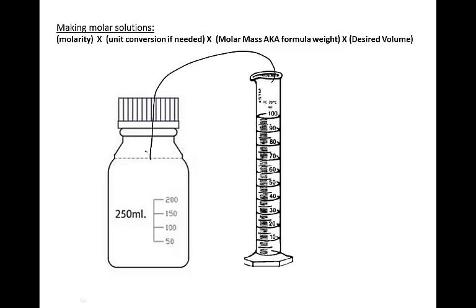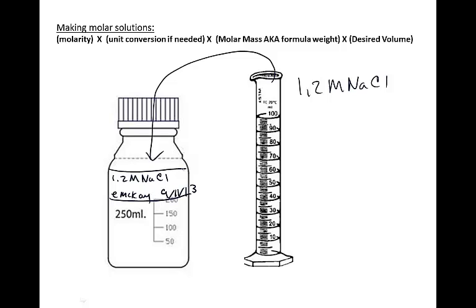We usually store things in objects like reagent bottles. So you would pour carefully your 1.2 molar sodium chloride solution into the reagent bottle of an appropriate size. You would add a piece of tape. You would write the concentration, 1.2 molar sodium chloride, first initial, last name, the date, and if there were hazards, that's where it would go. But this is salt water, so we can leave that off. And you have now made 100 milliliters of 1.2 molar sodium chloride solution.